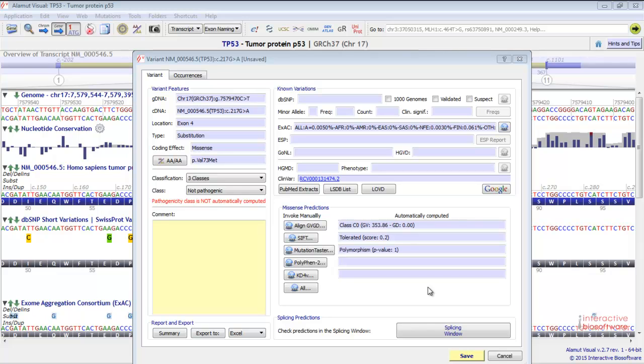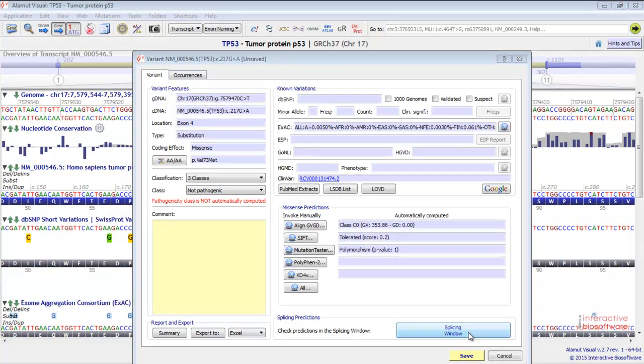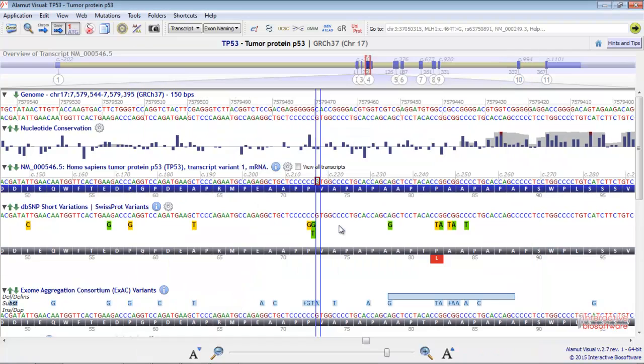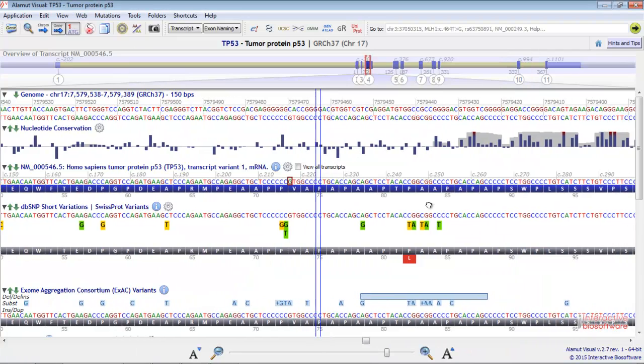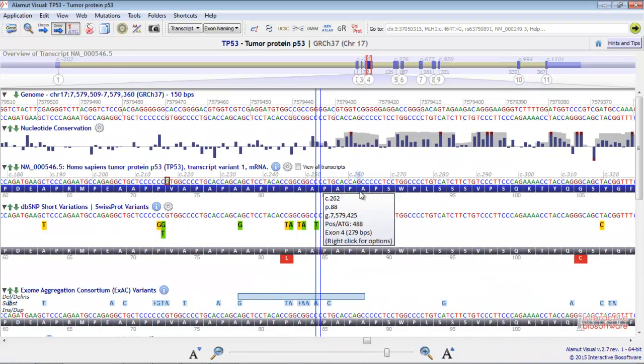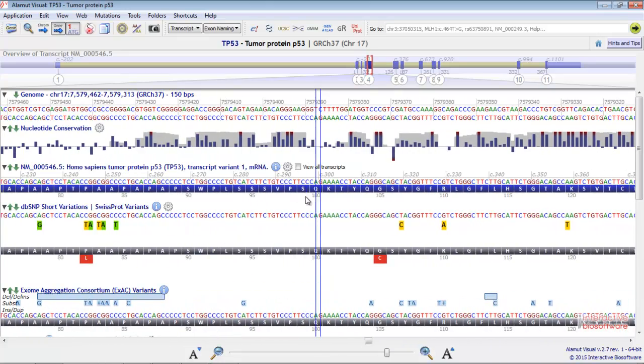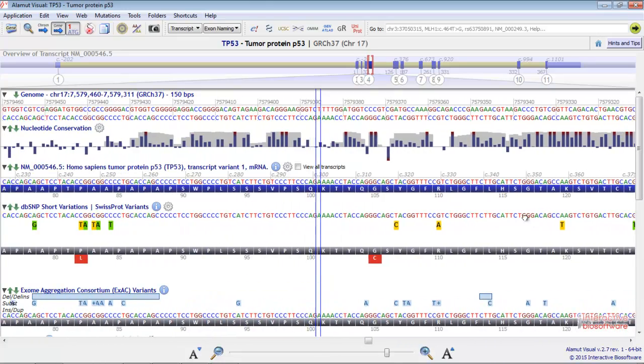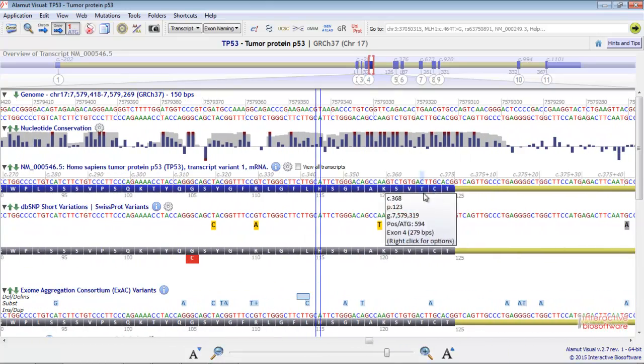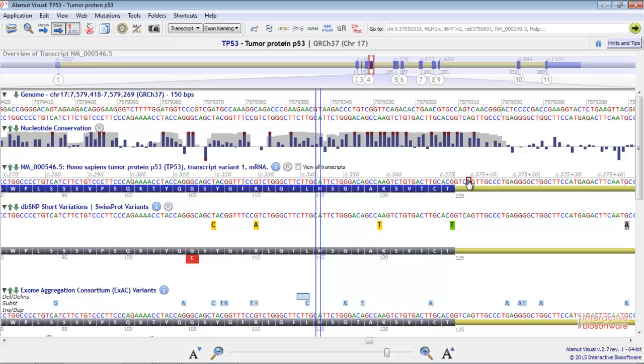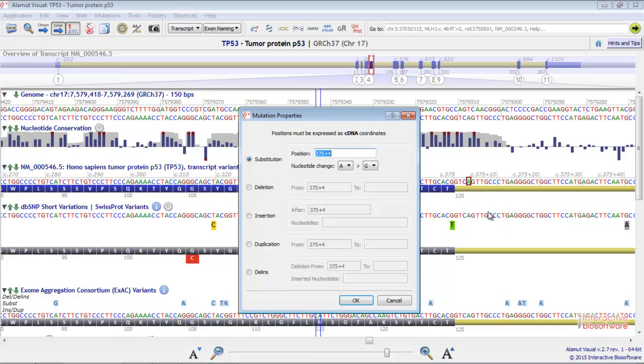We will now create a new mutation in order to visualize the predictions in the splicing window. Let's create, for instance, an intronic mutation in plus 4, and let's choose a substitution with the nucleotide change from A to T.